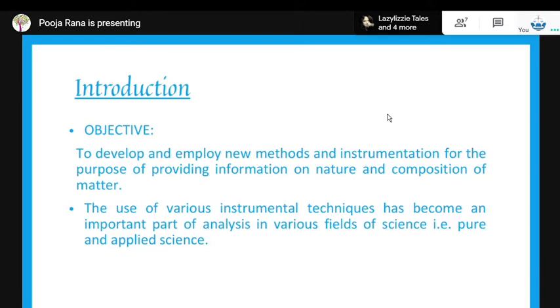But in biological laboratories also, apart from microscopic examination, there are so many techniques and instruments which are used, and eventually we just neglect the use of those instruments because we feel that the preliminary test is enough, to avoid the additional steps of giving the confirmatory test, so we avoid doing further examination of that evidence. So that is there.